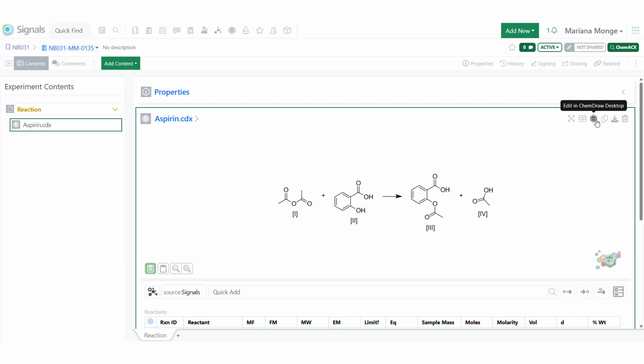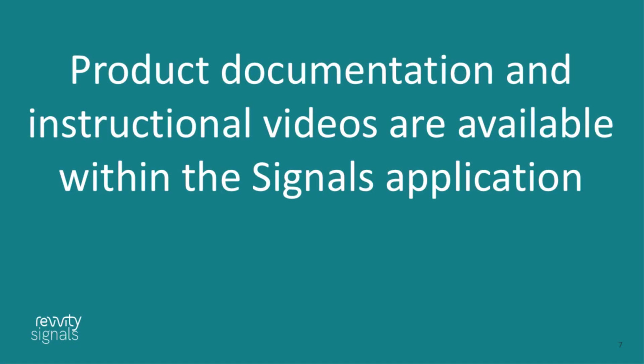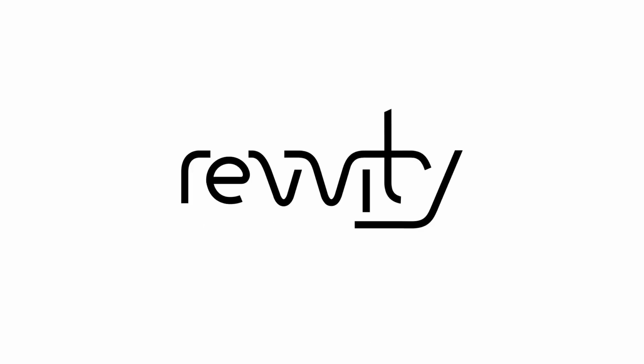This concludes the basics to start working with chemical drawings within Signals Notebook. By following these steps, you can efficiently create and manipulate chemical drawings to enhance your experimental work. If you need more information, product documentation and instructional videos are available within the Signals Notebook application. Additional support can be accessed from the Revvity Signals support page.